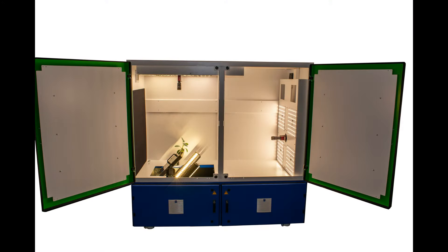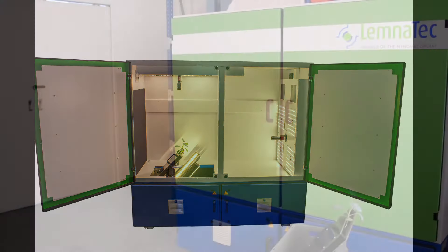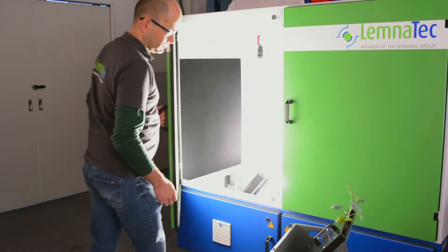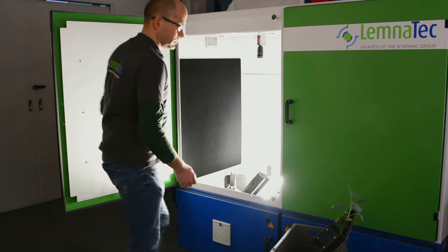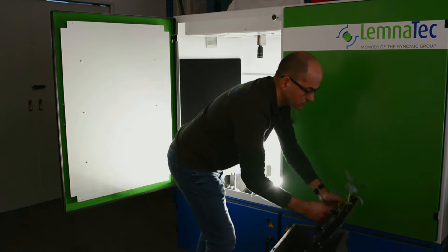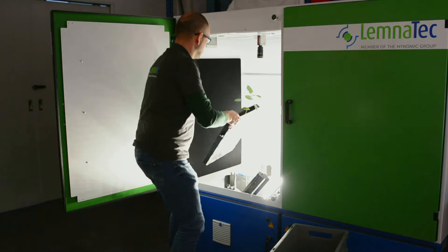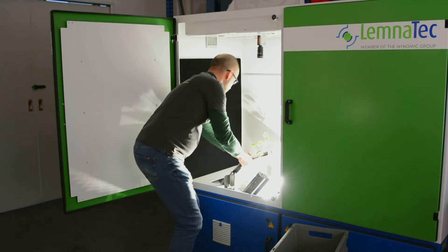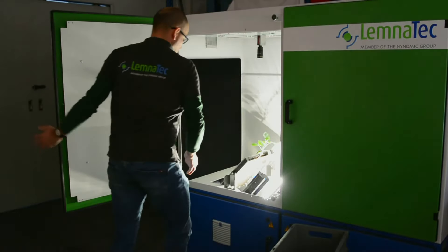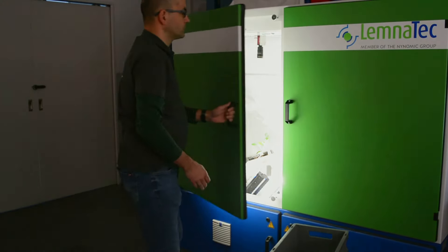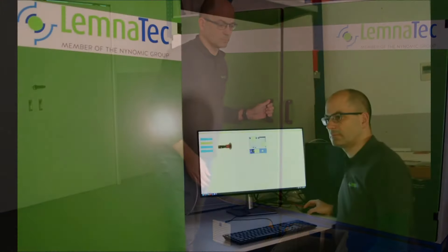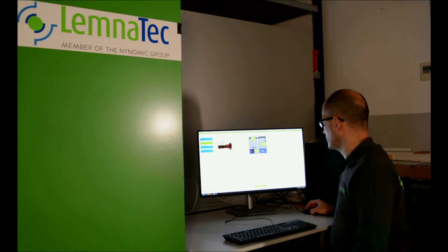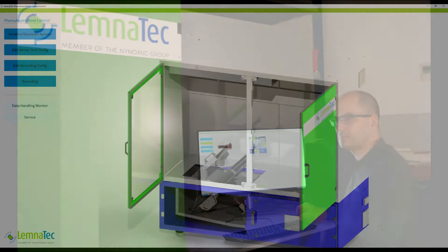How to work with PhenoExpert Pro Root. As first step, place a Rhizotron inside the imaging cabinet. Put it on the holders that place the Rhizotron at a 45-degree angle.